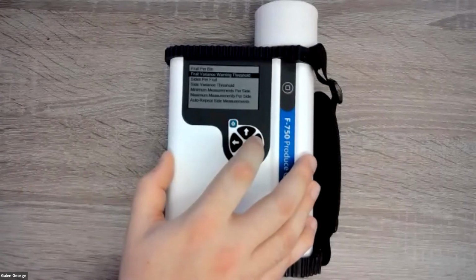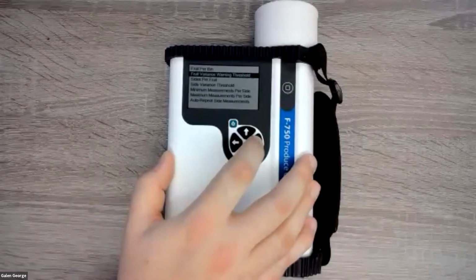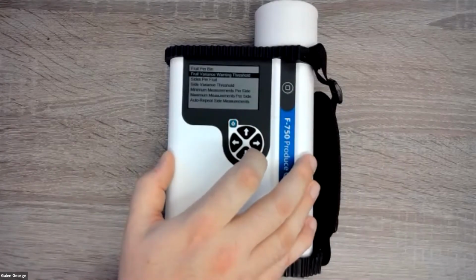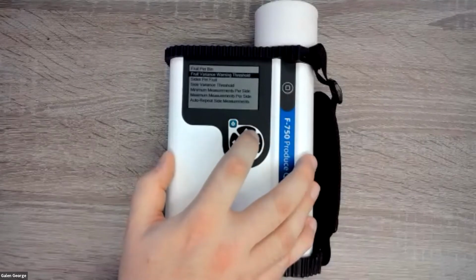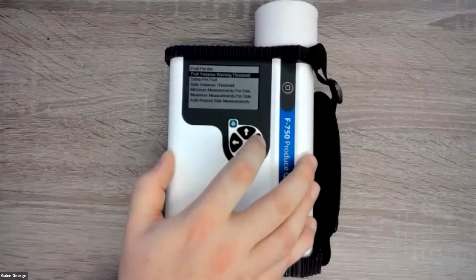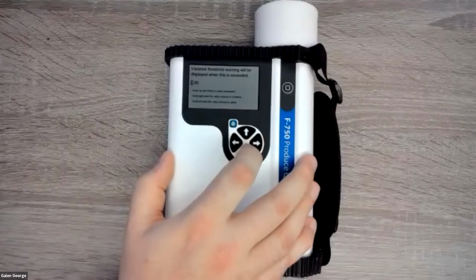So if you wanted to set a threshold that gave you a warning every time a new fruit average was more than, let's say, 5% different than the previous fruit or the average of the bin, what would happen is you would input 5 into this menu. That's because you want a 5% dry matter difference is what you want to be warned about.